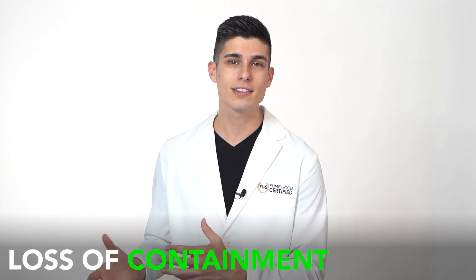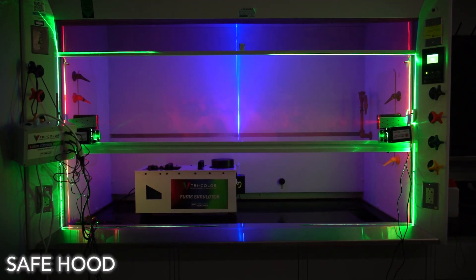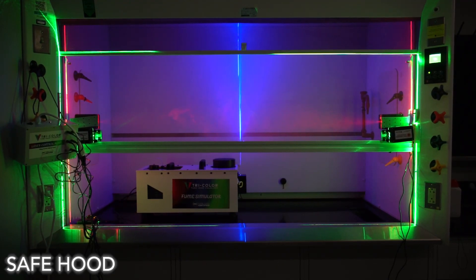If you can see green, that's loss of containment. Your hood might have a problem and should be repaired. If you don't see any green, you can be certain that your hood is performing safely.